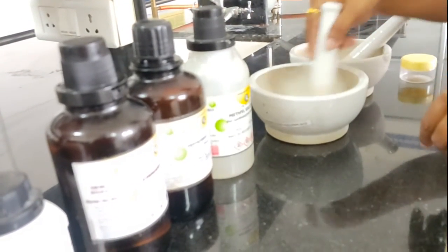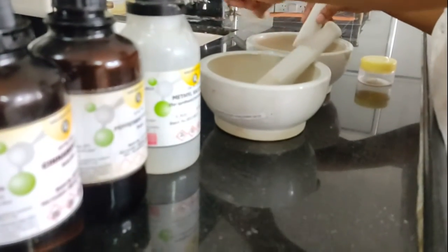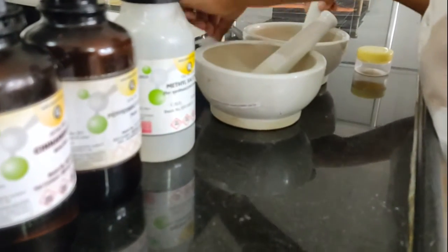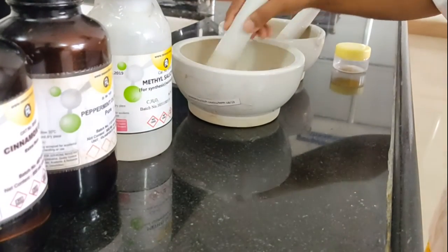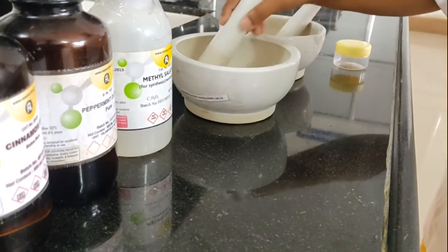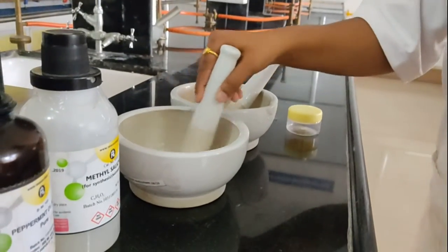Then I will properly mix all these added ingredients in the mortars, and after that the last addition of the hard soap is done into both mortars. Then we will again properly triturate all the ingredients in both mortars.